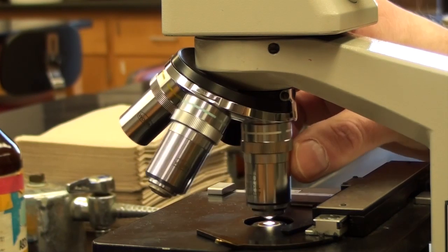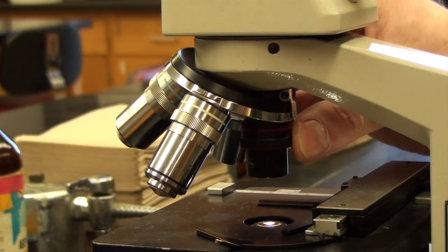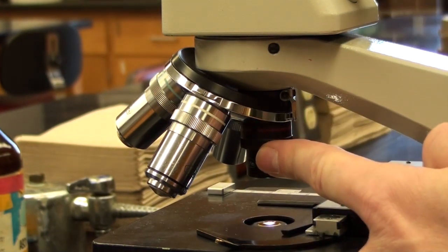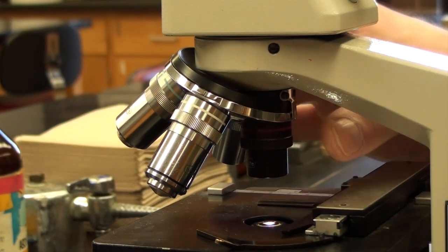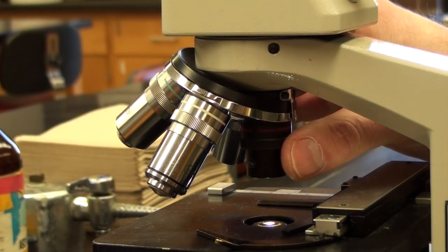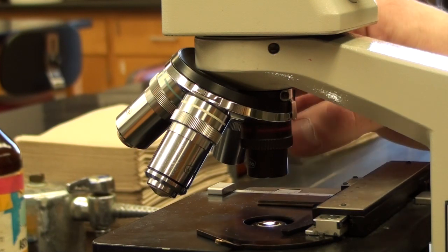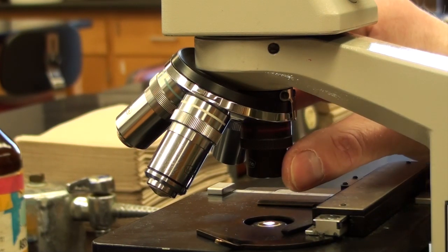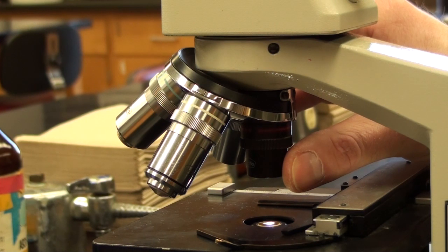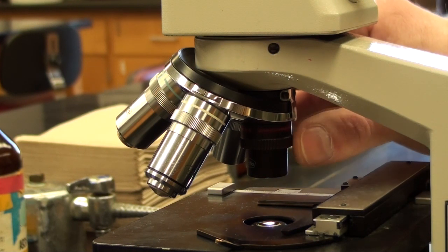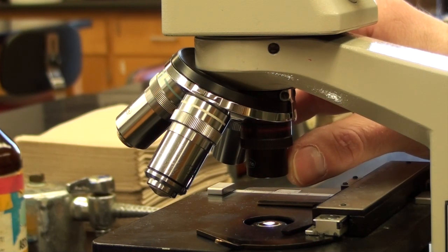The actual magnification of the microscope is determined by taking the objective lens and multiplying it by the eyepiece. In most of our cases, it's 10 times power. So in this particular case, where I have a 4x lens and a 10x eyepiece, I would be magnifying the object 40 times its normal size.